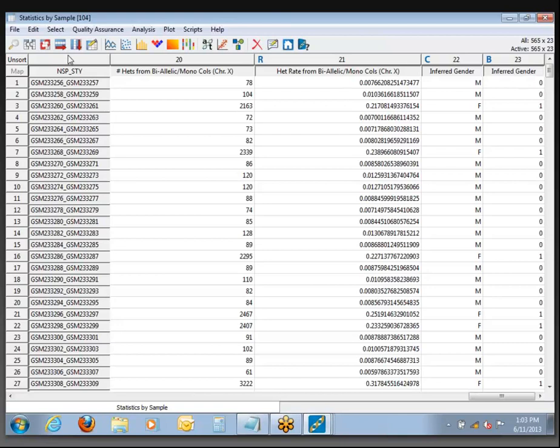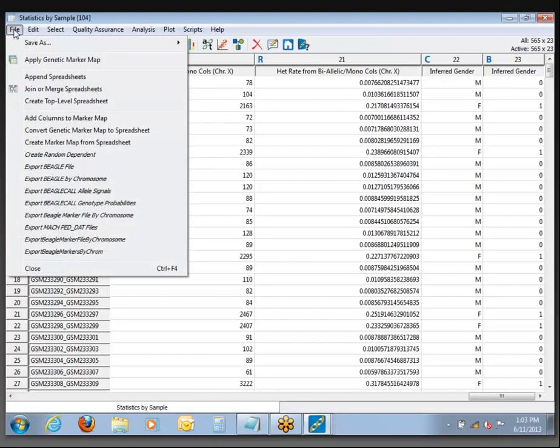You'll notice that in all of the spreadsheets there are column headers highlighted against a gray background, and row labels also get a gray background. As long as you have consistent labels between spreadsheets, that's what allows you to do any functions that require cross-referencing. So if I want to do a merge, I would come to the File menu and choose Join or Merge Spreadsheets.